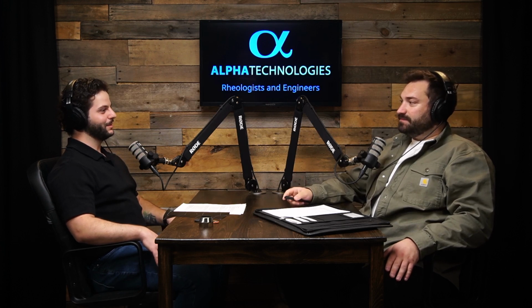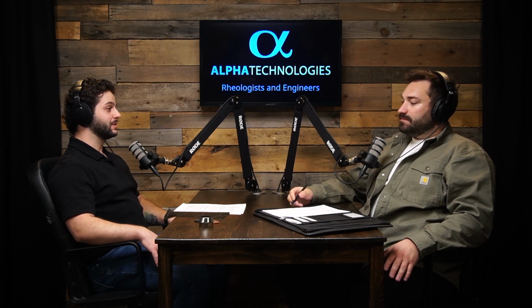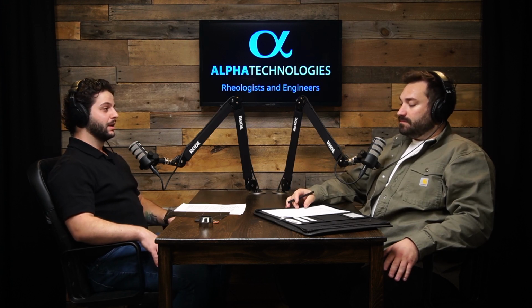Thank you very much, Rick, and happy to be here. This is Unal. I'm a senior scientist and applications team leader at Alpha Technologies. I specialize in the rheology of composites and polymeric materials such as rubber compounds, as well as the composites too. So the recent study that we have conducted is troubleshooting common prepreg failure modes using rheology, which is a really interesting and an important topic for composite manufacturers.